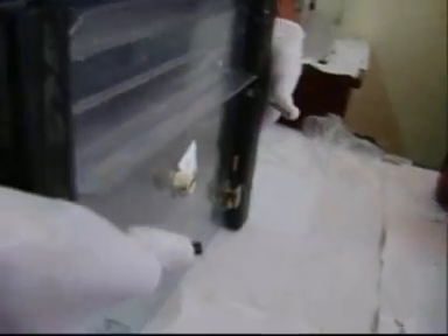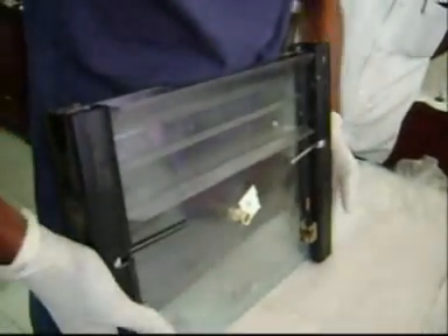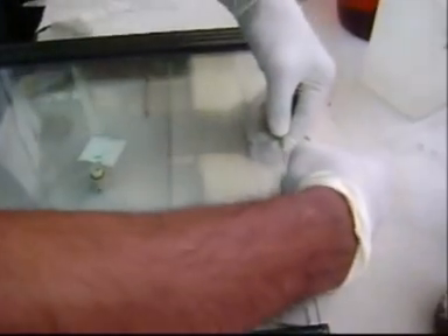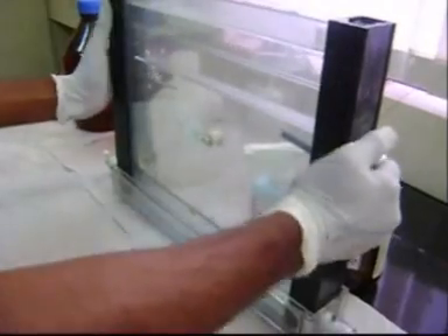Untie the clamps and place the comb within the glass plates. Then insert the whole glass plate set into the gasket and tighten it with the help of the screws provided on the gasket.